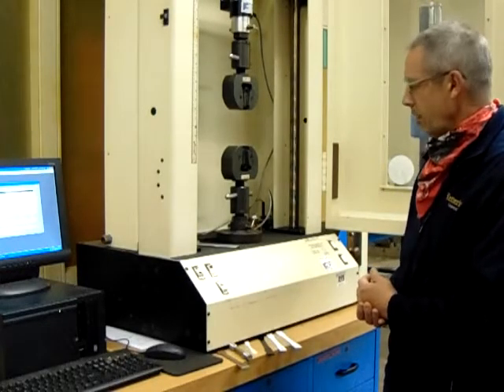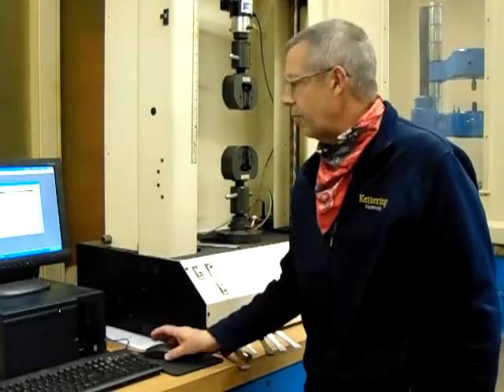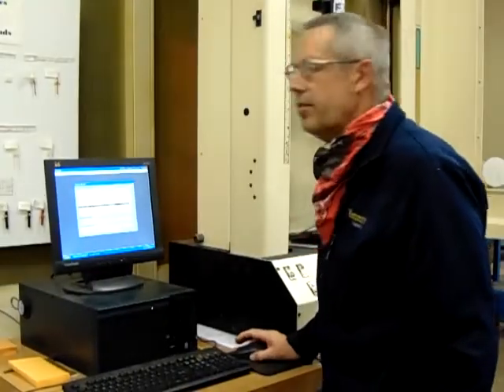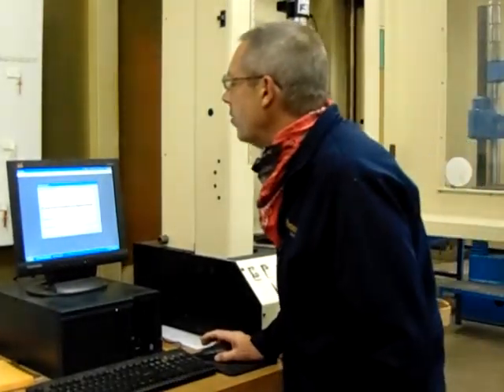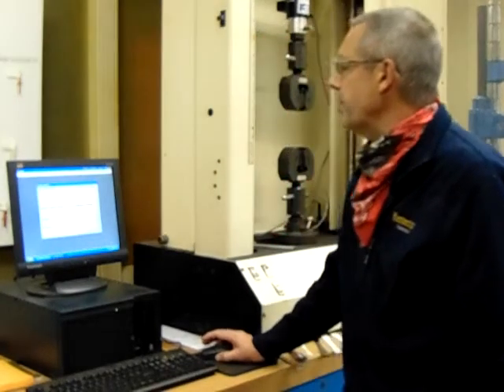So today we're going to use our U2S machine and break one of these 3D printed dog bones. We're going to go to ASTM 102, which is the spec number D638, tensile testing properties.